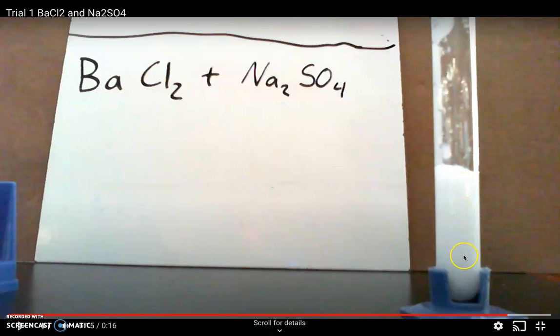That's what's known in science as a precipitate. So you take two clear, transparent mixtures and you pour them together, and then when a cloudy mixture forms when they're mixed, we call that a precipitate. It's kind of like how in weather, when there's precipitation, there's usually clouds up in the sky. At least that's how I think about it.